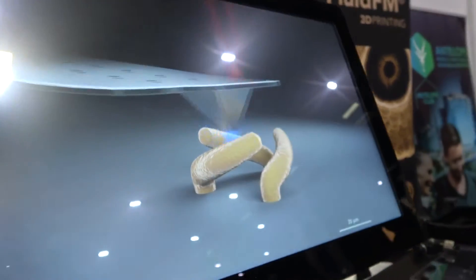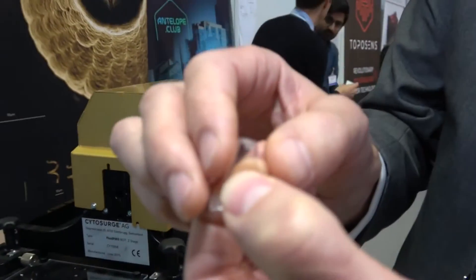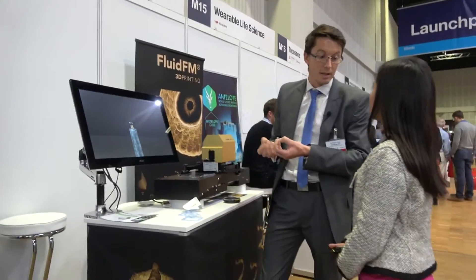And can you tell me a bit more about what you have here? Basically, these are the tips — these are the print heads. It's very consumer friendly. On this one we have a micro chip on the tip. This is basically an AFM cantilever, and the cantilever is hollow. There is a micro channel inside where we can bring femtoliters of liquid to a specific location and so into our printing chamber. With these femtoliters we are able to print the metal objects out of the metal ions.